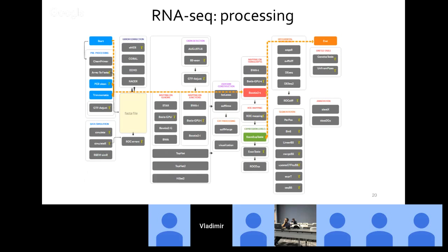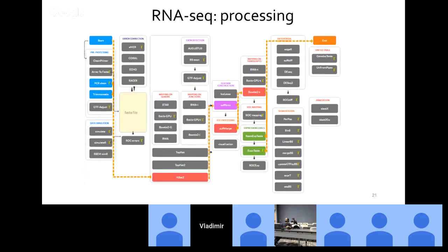In case if we want to at least try to look at novel transcripts, we simply add several modules to our pipelines. These modules additionally perform mapping on genome, gather exons into potentially new isoforms or even potentially new genes, and then combine the set of initially known genes with the set of genes that are identified by the pipeline.